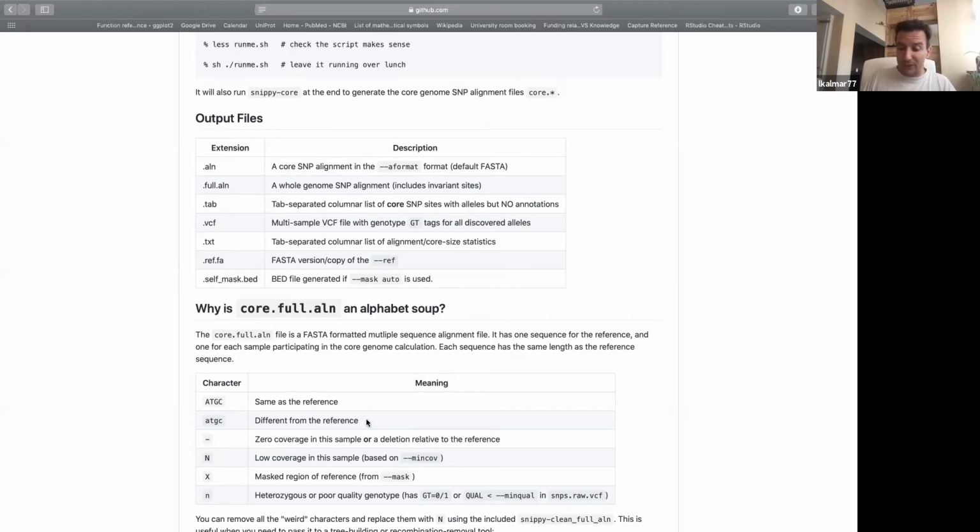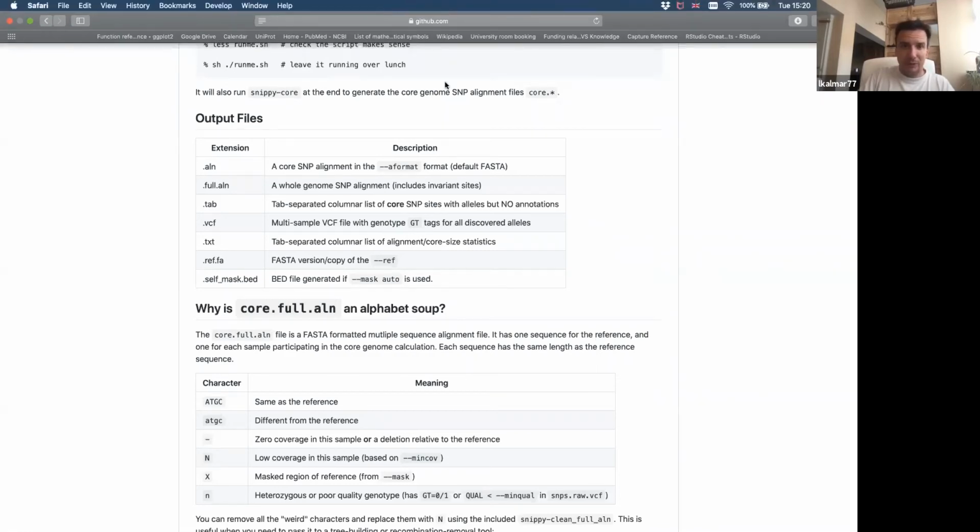It's definitely not good for finding new genes or finding accessory genome differences. I hope this is clear. If anything is a bit messy when I'm speaking, please stop me or ask me on chat, especially if I open the chat window as well.